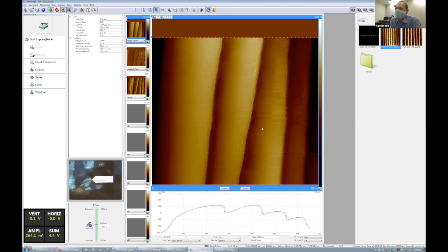How many samples you can image with one will really depend on the sample and on the operator. If your sample is clean and not very aggressive, so some kind of a flat surface made of a very smooth material, not too hard, you can image 100, 200, 300 images if you're very careful.